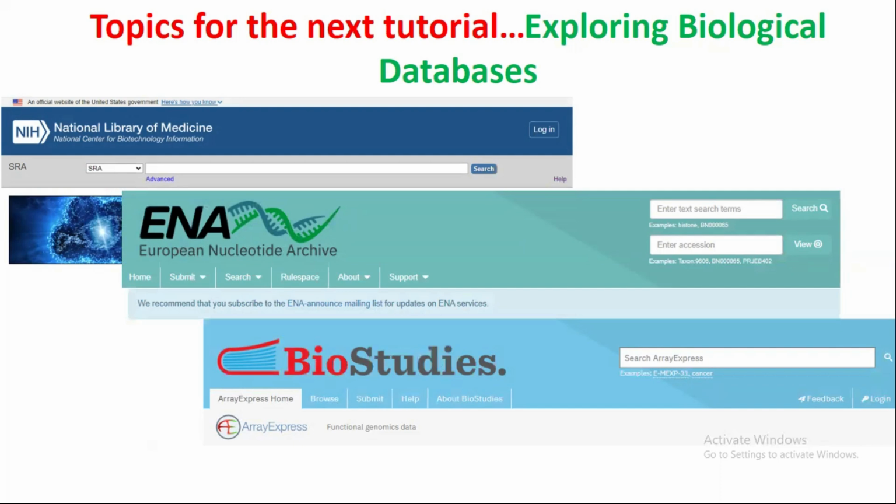Secondary data is present in these biological databases, because we are now going to perform data analysis. Most people in Western communities generate their primary data and perform their thesis or research on it. But most researchers also perform data analysis on the data present in these biological databases. So we are going to use these databases, retrieve our data, and start preprocessing it. Now we are diving into the data analysis step.